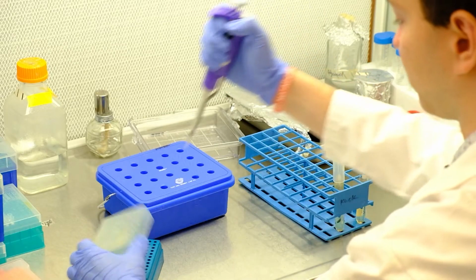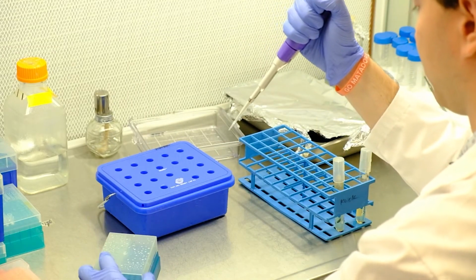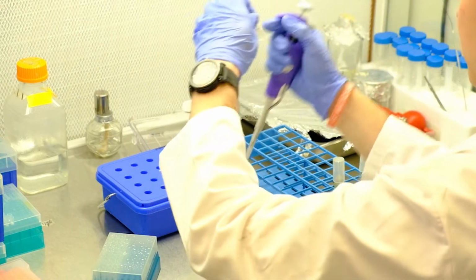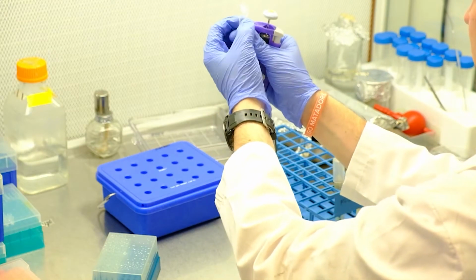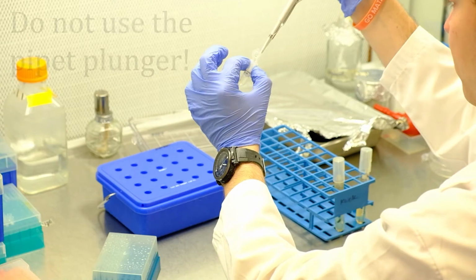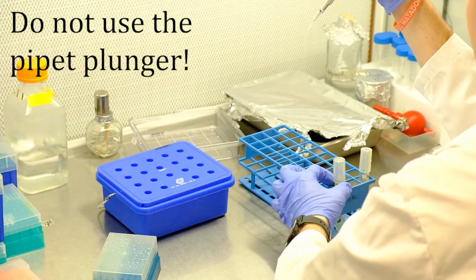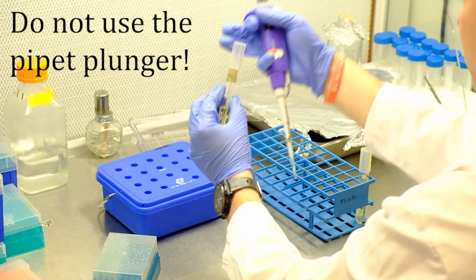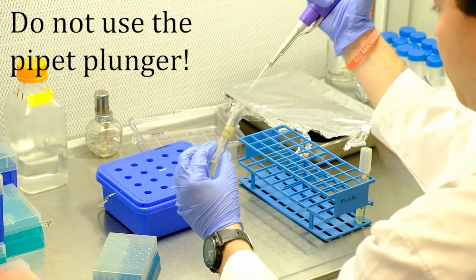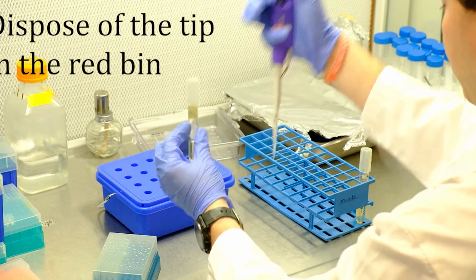Once your work environment is sterile, attach a tip to your pipette. Carefully open your cryoculture tube and briefly touch the cryoculture with a tip. Then open your media as shown, and again touch the surface of the liquid with your pipette tip. This tube is now an inoculated culture.